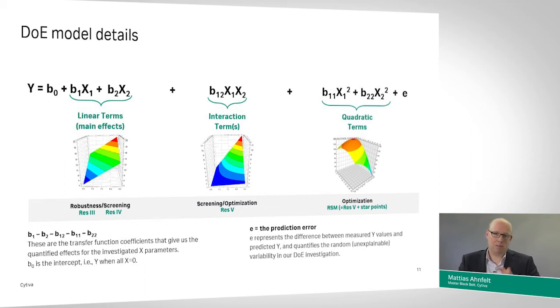However, if you go to the back of this middle response surface, you'll see that the same change going left to right now implies a drastic increase in our response. So changing the x2 parameter from being in the front of the picture to the back of the picture changes how x1 moving from left to right affects our response. That's an interaction effect, and we will exemplify that again in slides to come.